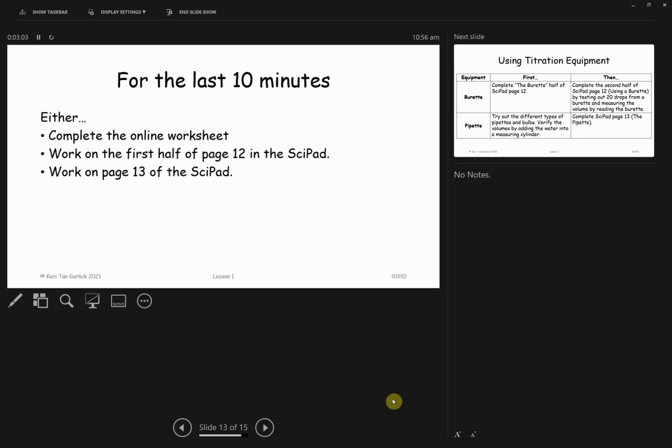Yeah, because you want to say either is it on the line or is it between 2 lines? Between the 2 lines, and a 5. That makes you say it's half. 2 decimal places. Units as well. Oh my goodness. Is it milliliters? Yes.